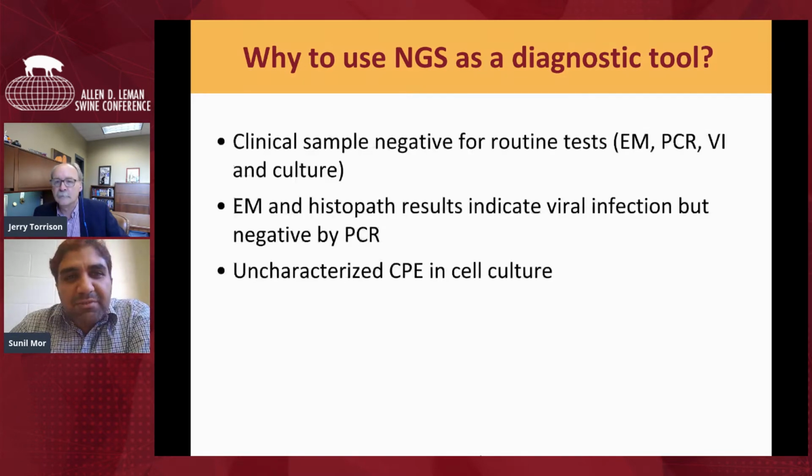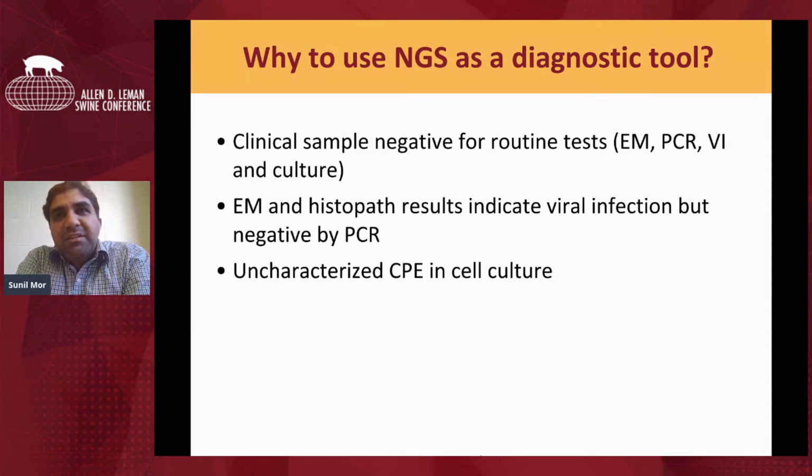To start with, first and most important, if there are clinical signs but we do not have any information, or the clinical samples are negative with all our PCR tests or the routine tests, then the only option is to consider next-gen sequencing to find out what's present there.